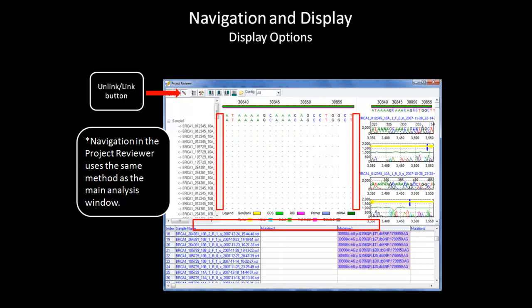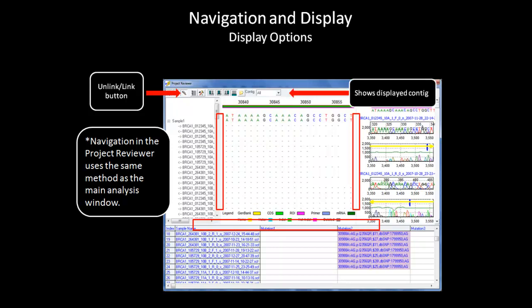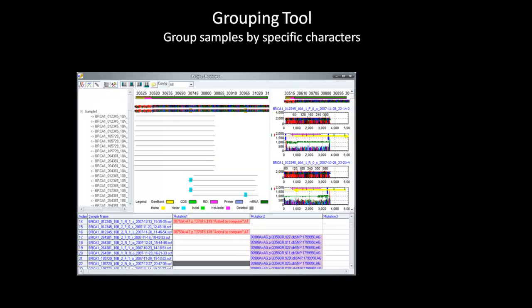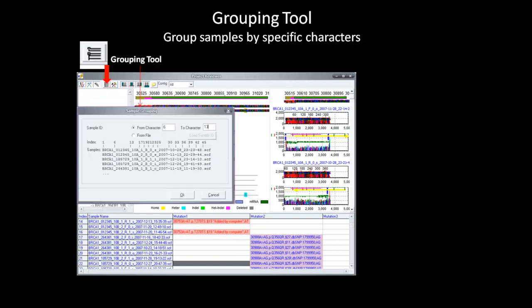You can choose specific contigs to observe or choose the all option to view all contigs at one time. By choosing to display all, the project reviewer will overlay all samples into a single view relative to the GenBank file. I will now move on to the grouping tool in the project reviewer. The project reviewer has a useful tool to group samples by either specific characters or from a text file. This grouping tool is great for viewing replicate samples.